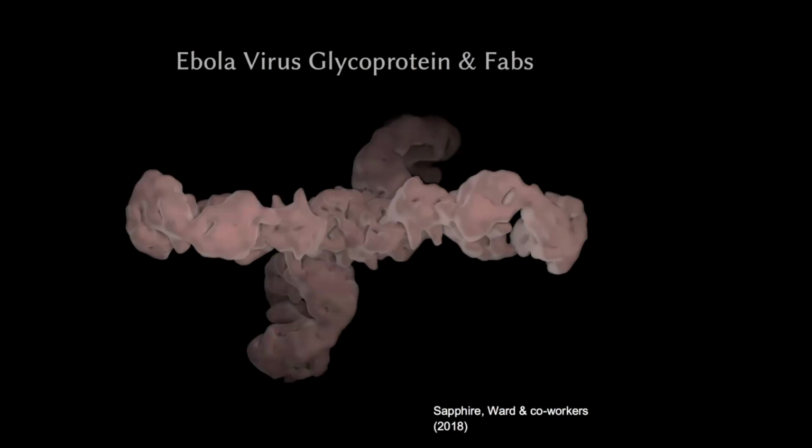The lighting here is not that which you typically associate with Coot. I've done a low pass filter, obviously, for this reconstruction, and you can see that this diffuse lighting and ambient occlusion is bringing out the shape of the protein in a way that was just not apparent or not possible in previous versions of Coot.